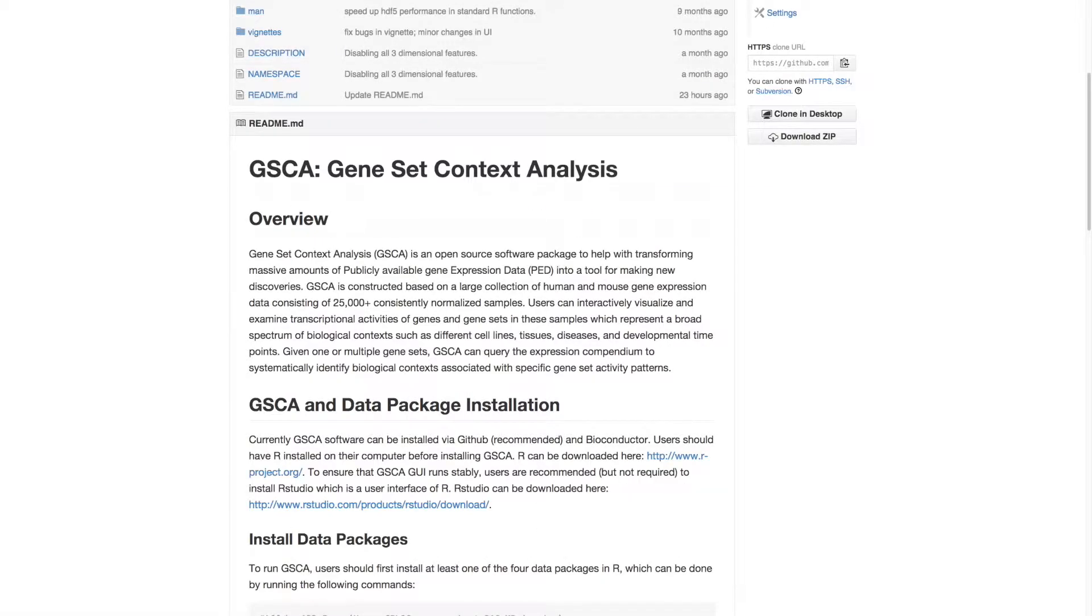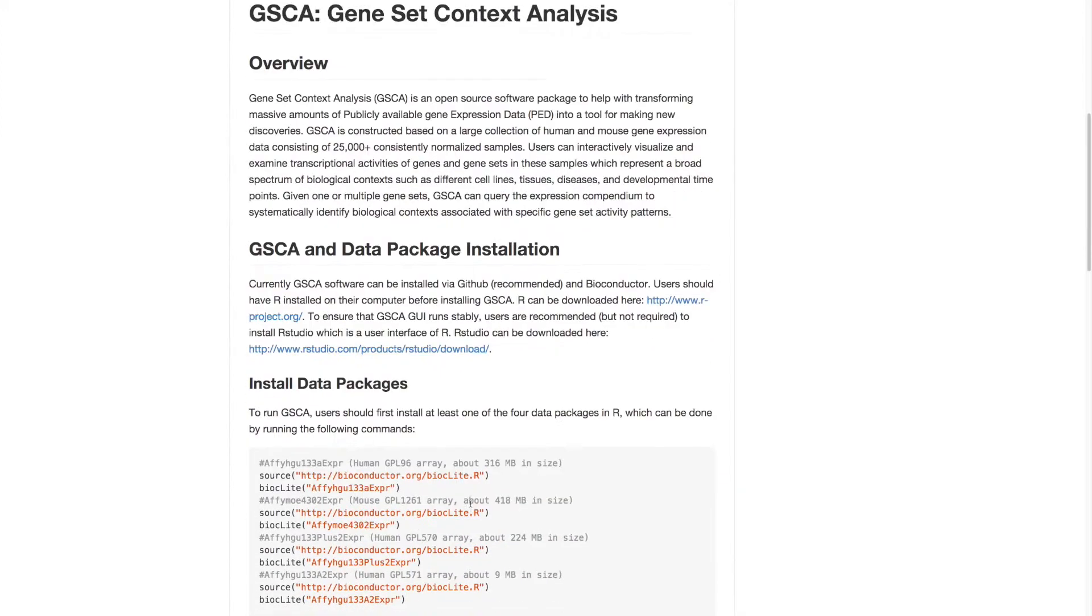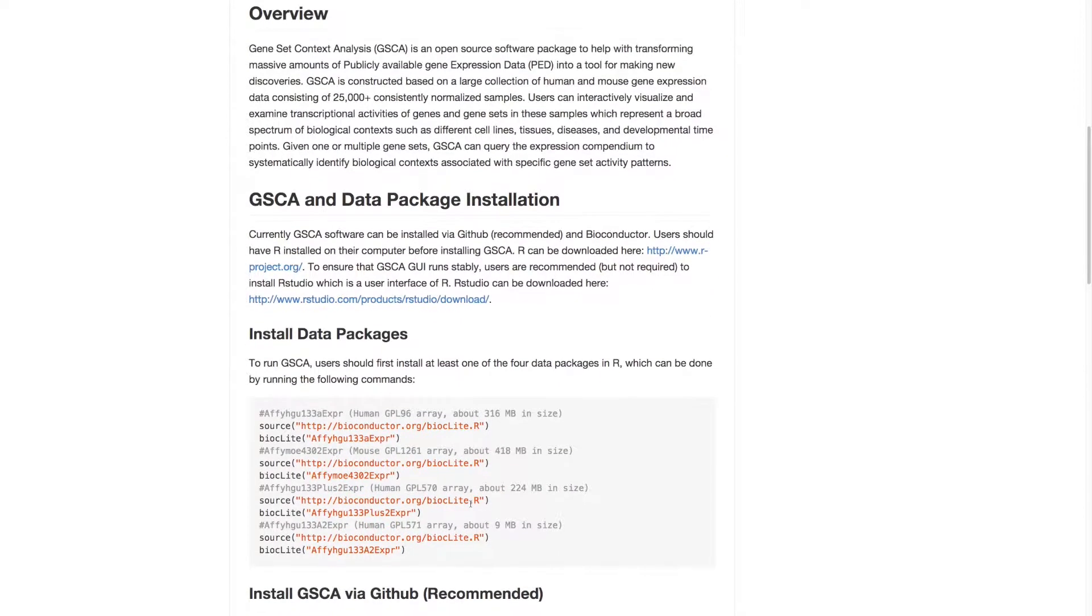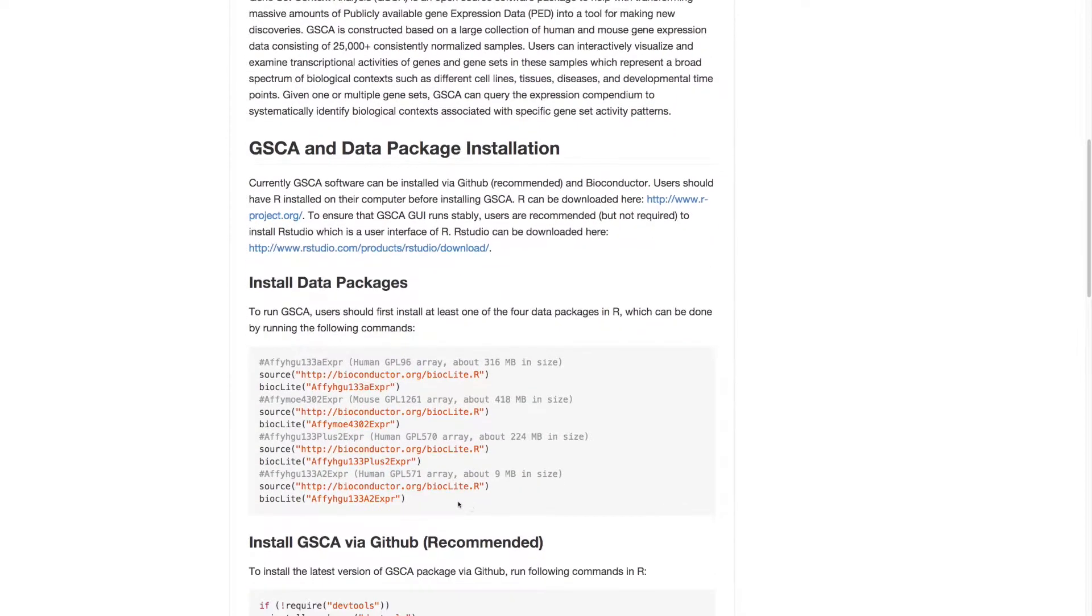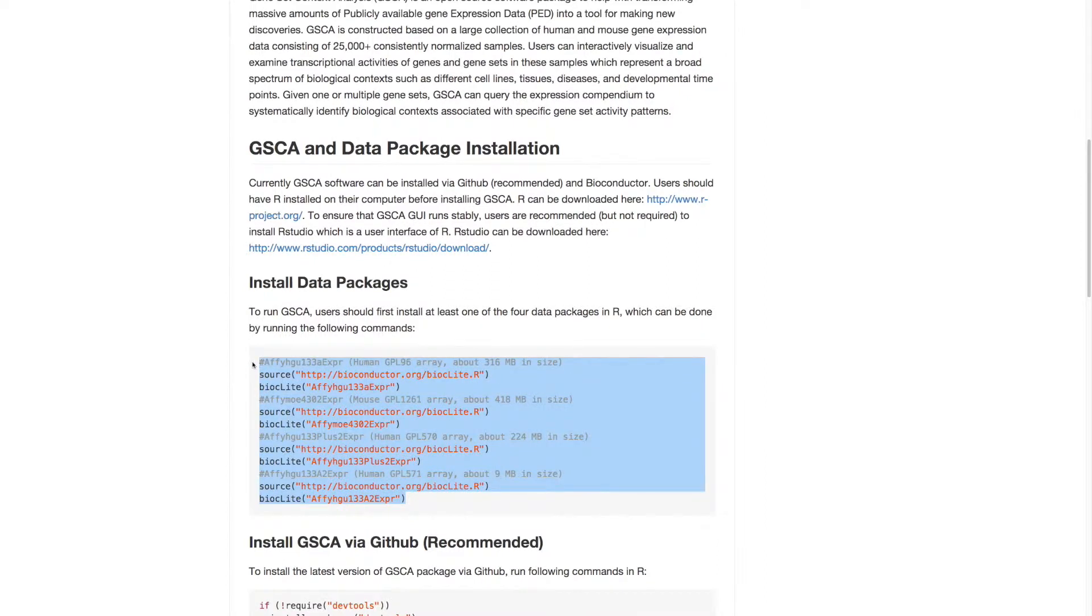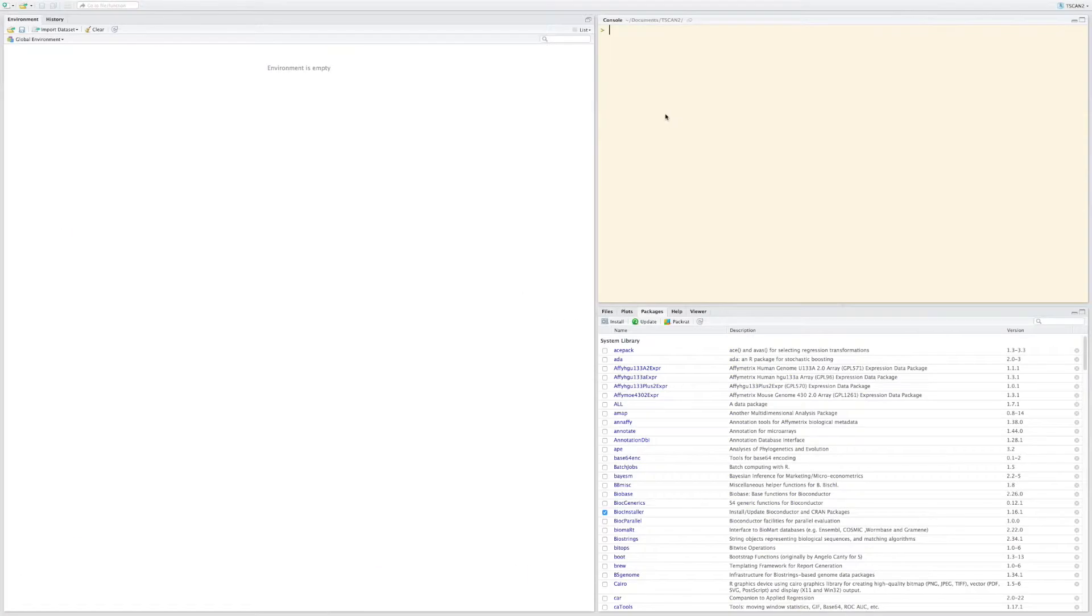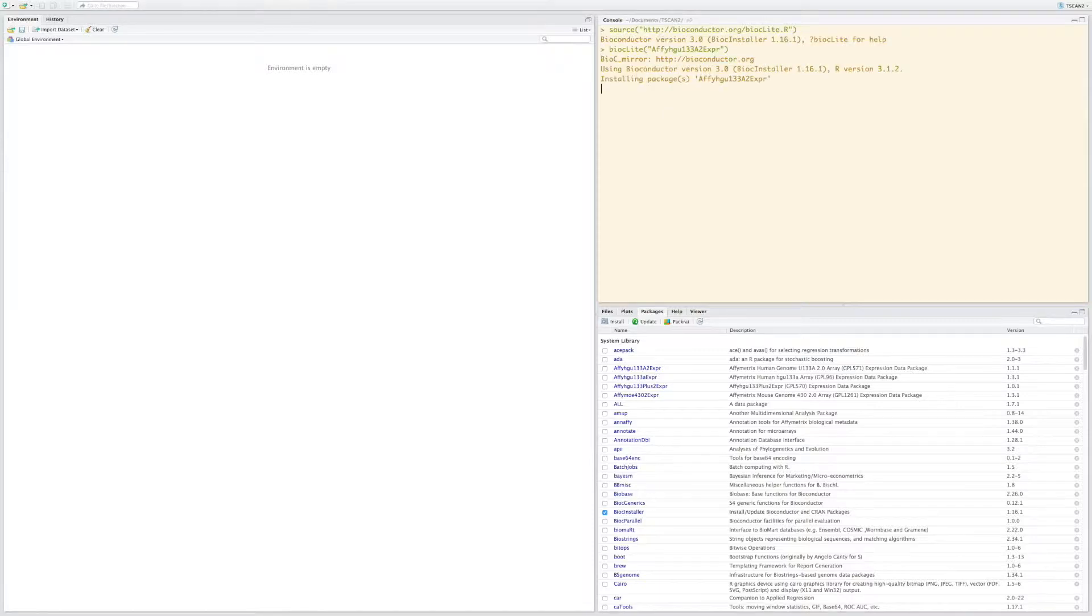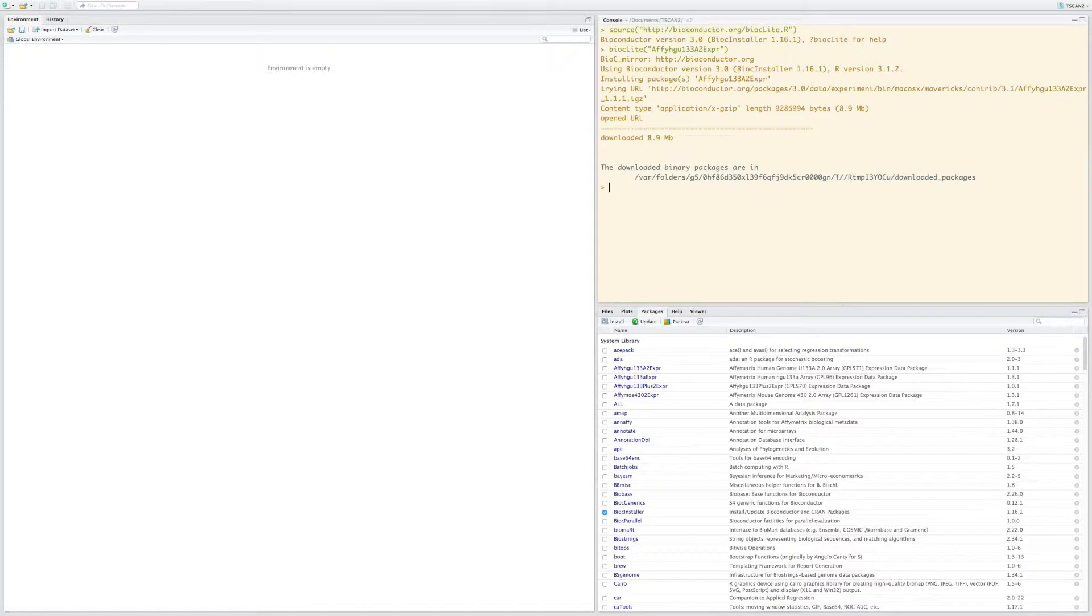GSCA depends on at least one of four data packages, which can be installed by Bioconductor by running these commands in R. For example, to install the data package FEHGU13382EXPR. The package has been installed.